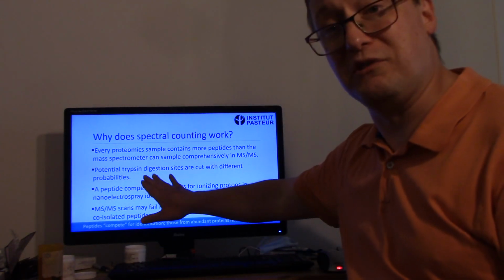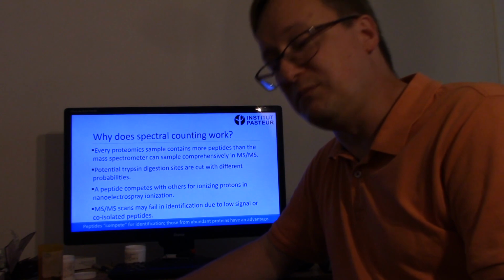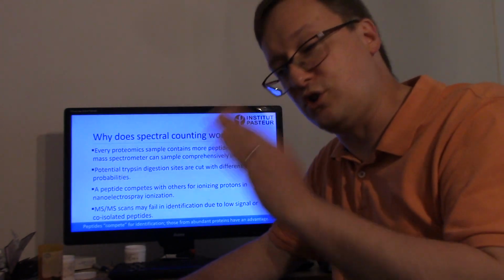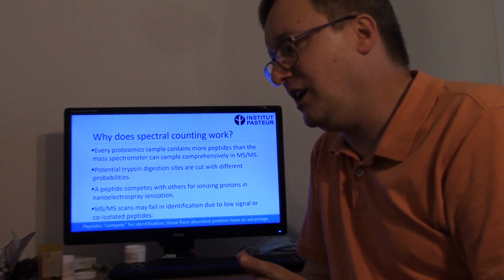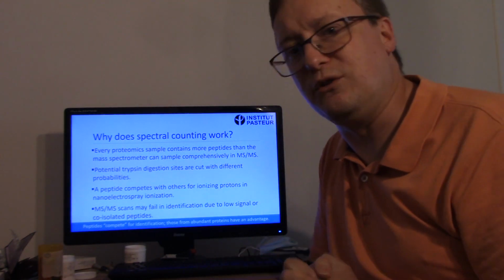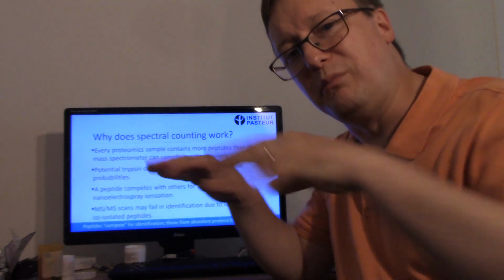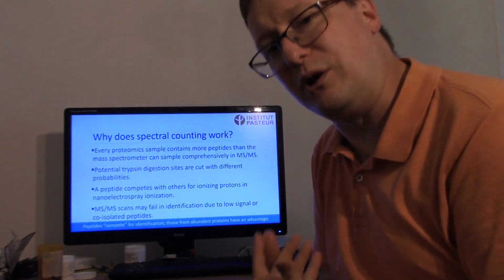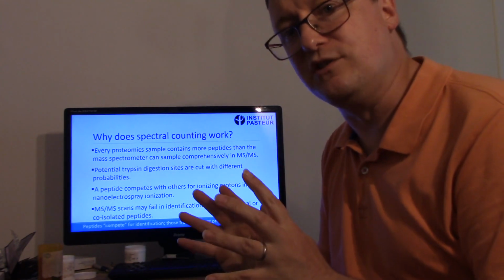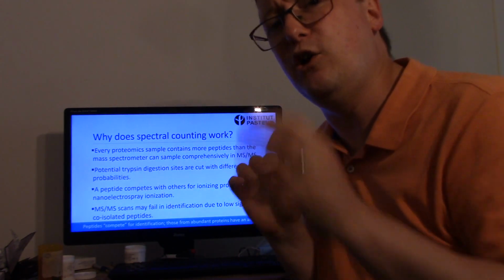Okay, so let's just start with something basic. If you were to use trypsin on different samples, trypsin would sometimes cut a protein to completion and other times it wouldn't. You can think of each site in a protein as having some probability that it will be cleaved under ordinary denaturing and reduced conditions. And yet, this probabilistic evaluation of how a protein gets digested has a weird implication: some peptides for a given protein are observed with very high probability and other peptides are produced with very low probability.